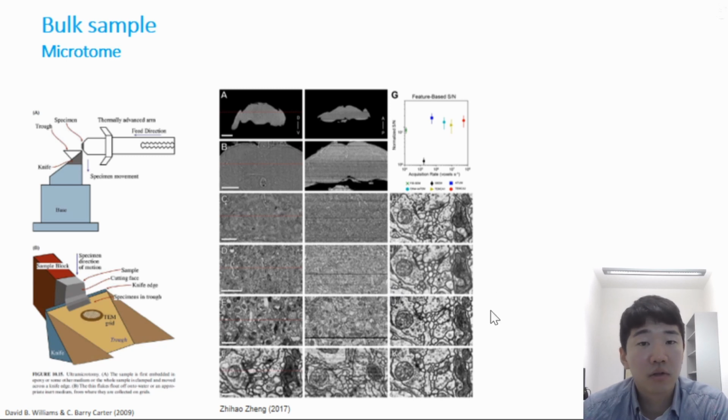The ultramicrotome operates by moving the specimen, several tens of nanometers thick, past the knife blade. The blade can be glass. Glass is cheap but should be used for soft materials. There are also blades with diamond which can be used for harder materials.